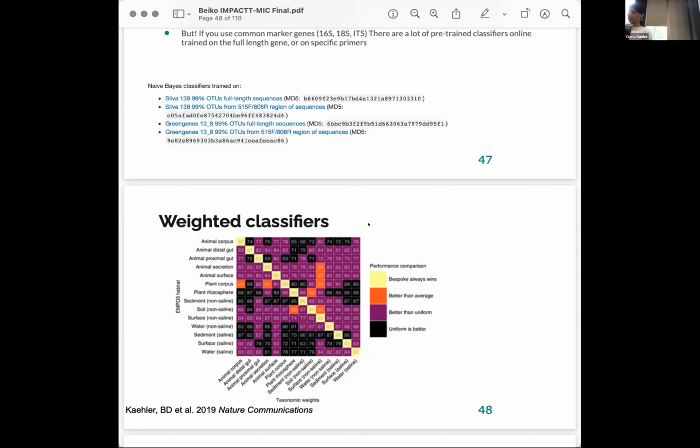It's kind of the first question they ask. They must share a little bit of sequence similarity, and then we go through our probability model of answering whether or not these two sequences come from the same organism.